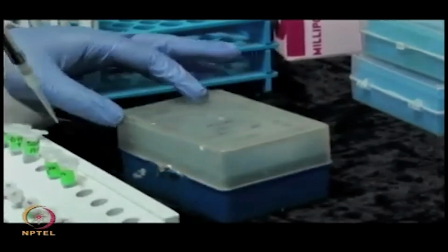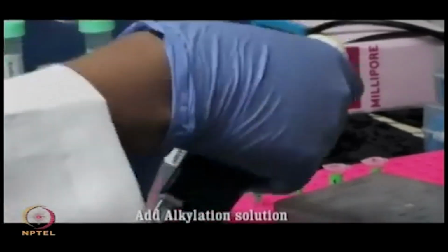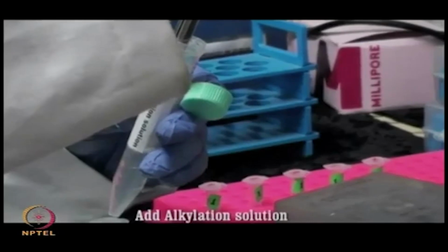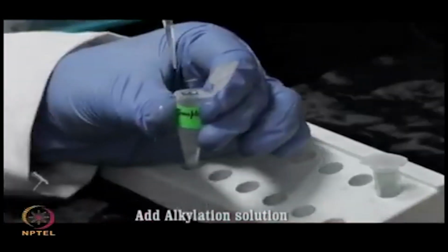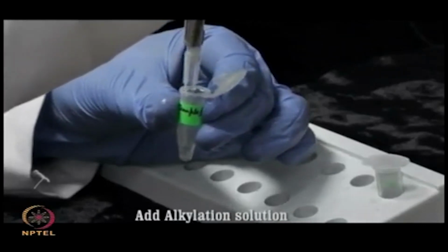Then add alkylation solution. Add 30 to 50 microliters of alkylation solution and incubate it for 20 minutes at room temperature in dark condition.